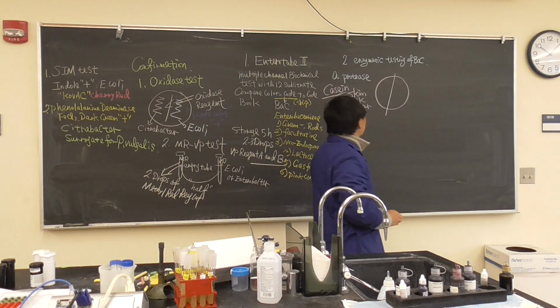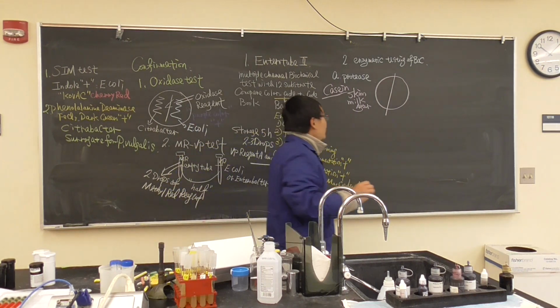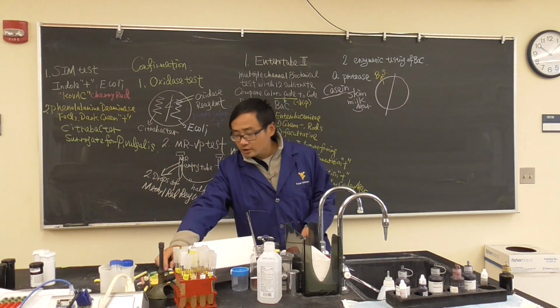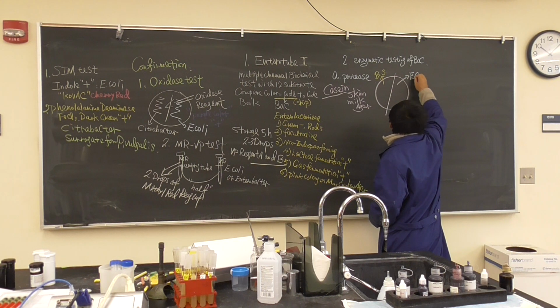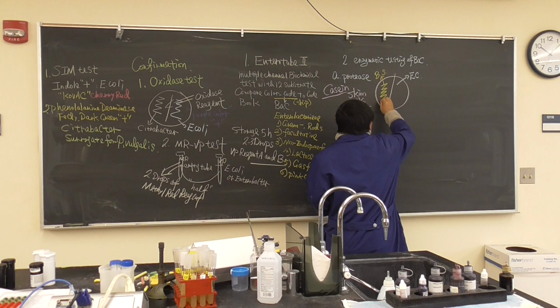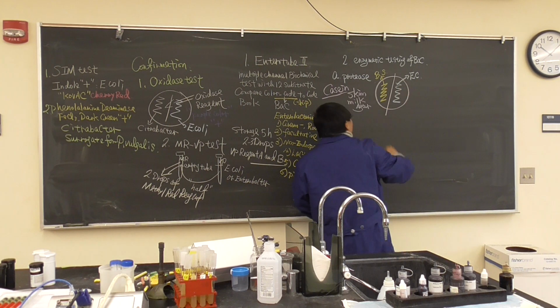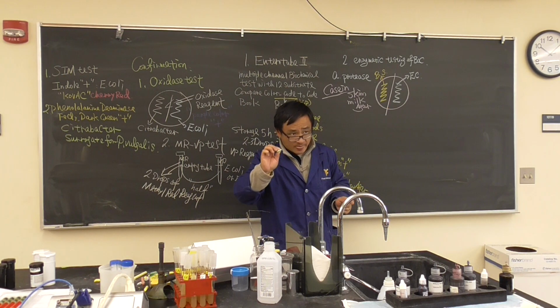You have a skim milk agar, we'll split it into two. On the left side, you will label Bacillus subtilis. On the right side, you will add E. coli. And then what we do is a similar gentle streak. Okay, by the way, this is not streak plating. This is just where we make some smear there. Okay?